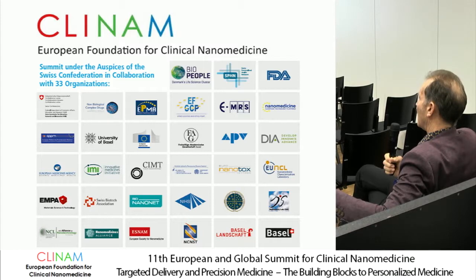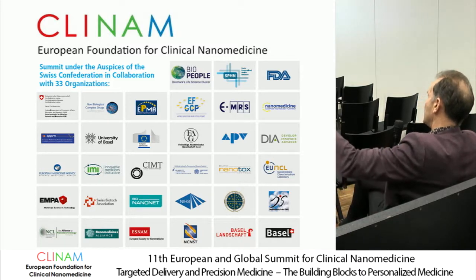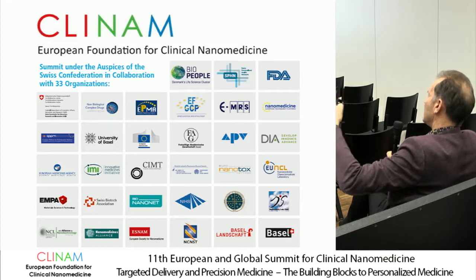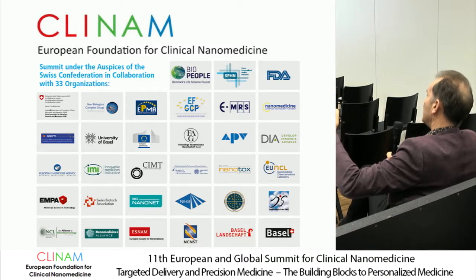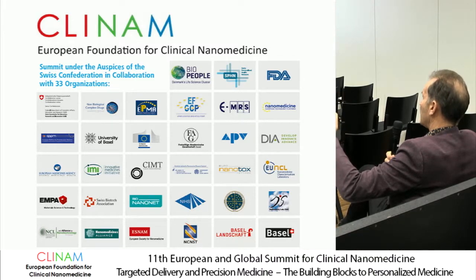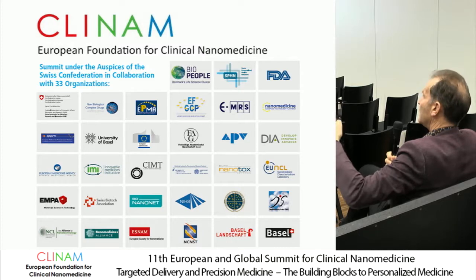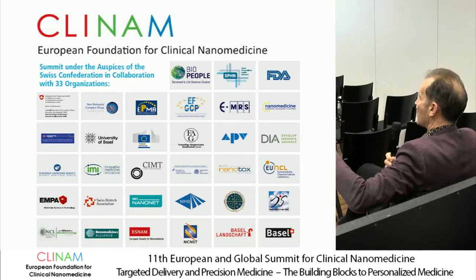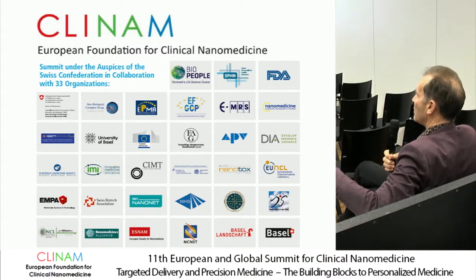One comment I might make about size, there's a good question: what actually is the size? What does it even mean? Because you've seen how many different types of particles there are. So you've got a gold particle, you can measure the physical size of the gold. You can use the hydrodynamic diameter, which is a different thing. If you've got ligands, then what does the size mean then? You know, you've got all these little fronds hanging off the particle. But what do you mean by size? Is it mass? Is it the outer diameter of the ligand? Or is it the volume of everything?